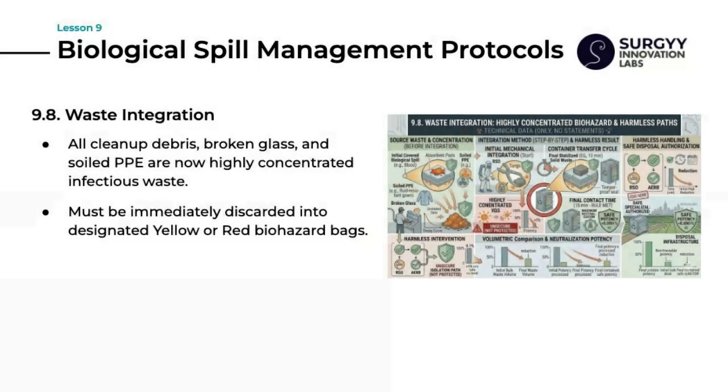Waste integration, detailed in Lesson 9.8, addresses the final disposal of all materials used in the process. All cleanup debris, because of this high viral or bacterial load, must be immediately discarded into designated yellow or red biohazard bags. This ensures that the waste enters the correct regulated medical waste stream for high heat treatment or incineration, preventing the hazard from re-entering the general waste system or the environment.